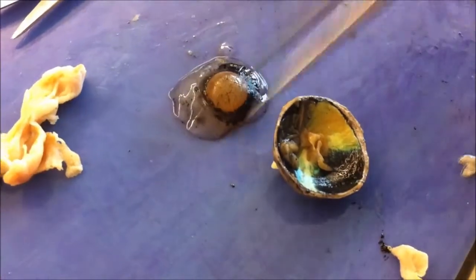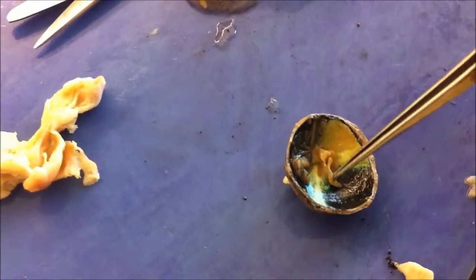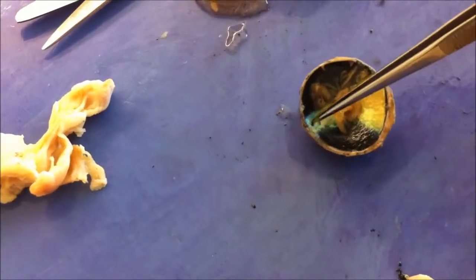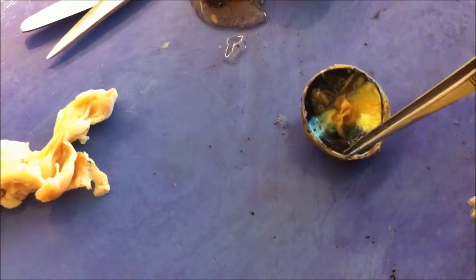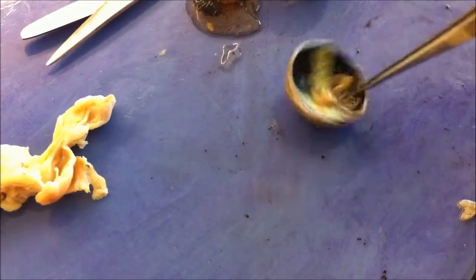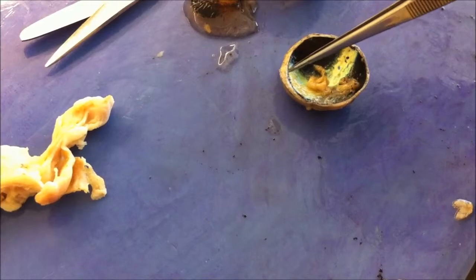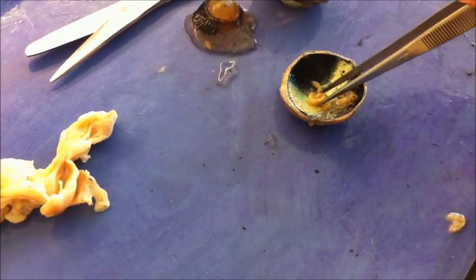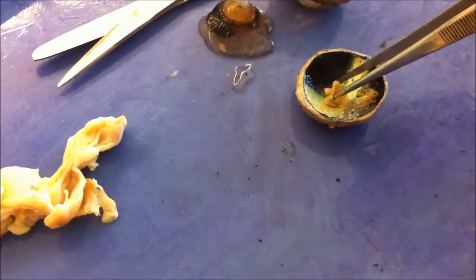Here in the posterior chamber, we have the tapetum lucidum, which is the green. The choroid layer is the black. Sclera, choroid layer, and the retina.